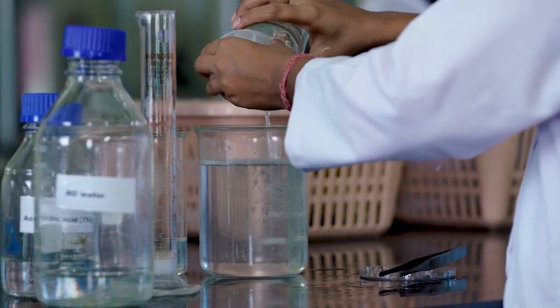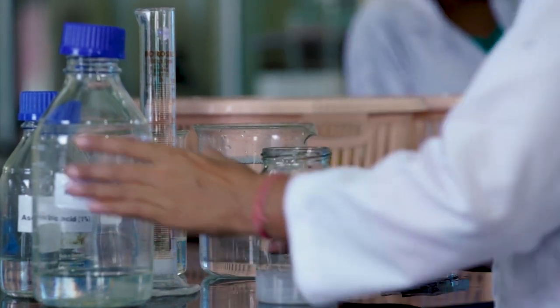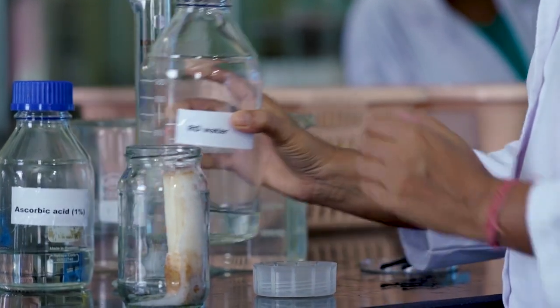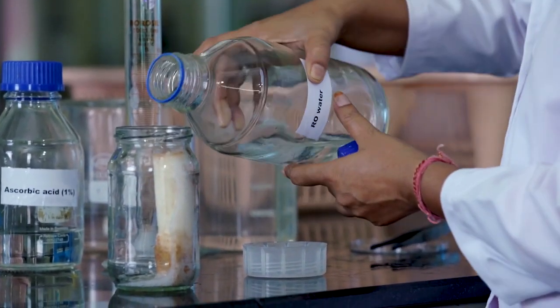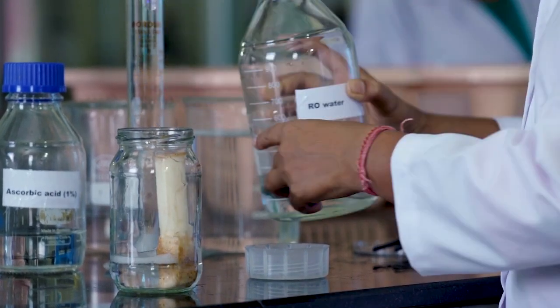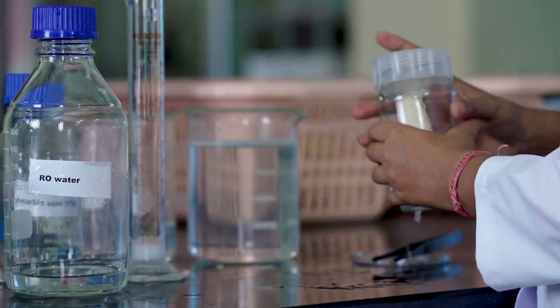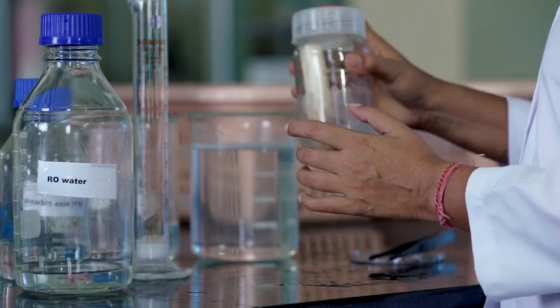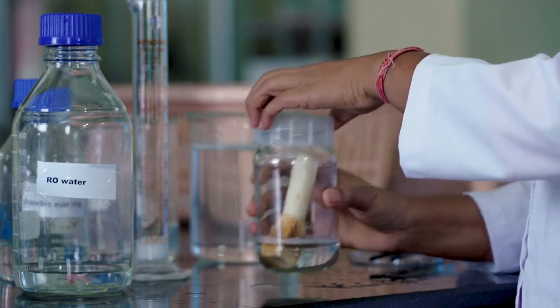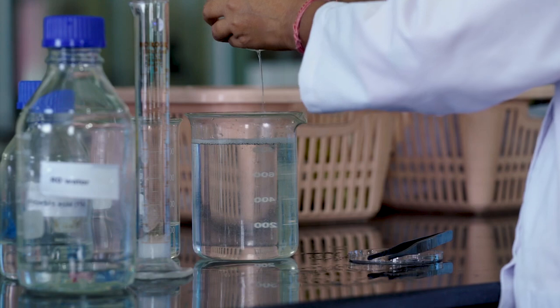That's because tissue culture is carried out under in vitro conditions in a glass jar and in an aseptic environment. Now this explant will be treated with RO water so that there are no remains of ethanol on the explant. Hope you all have got some idea about the sterilization process to carry out micropropagation.